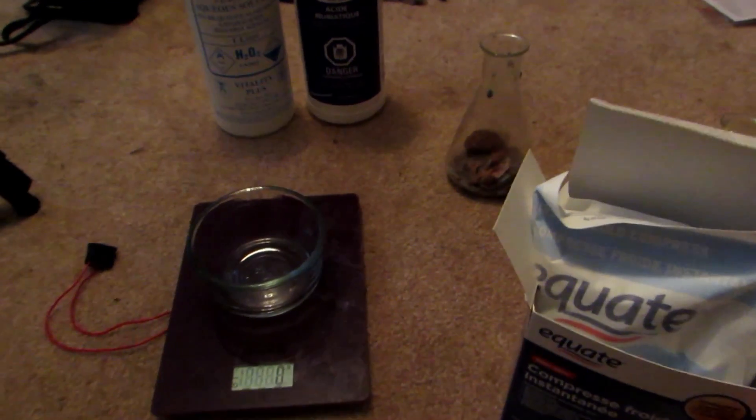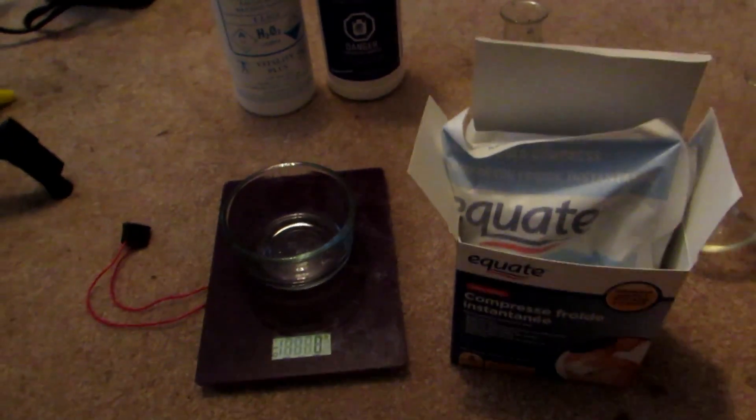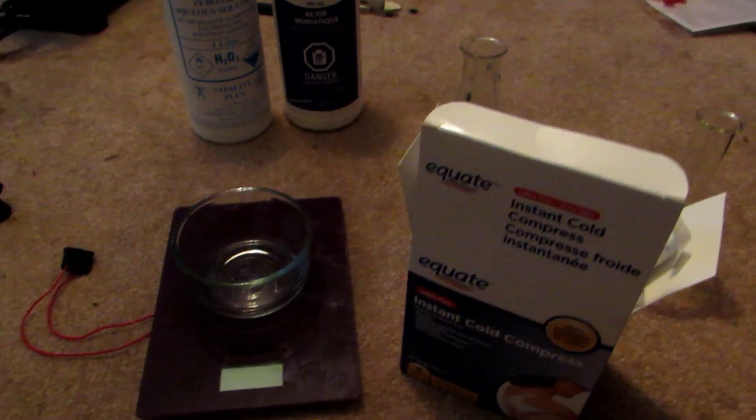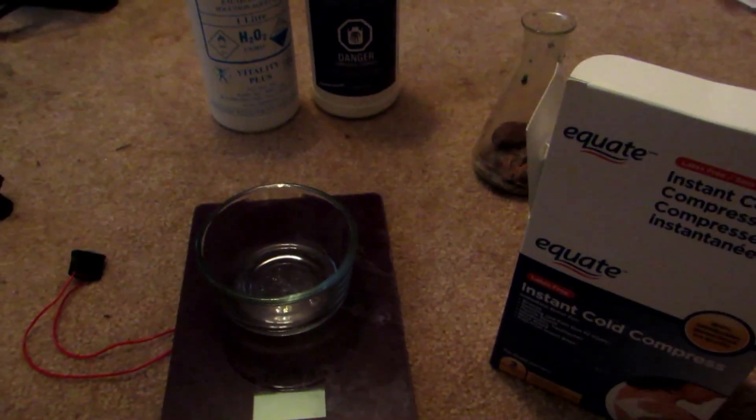So today I'm going to be showing you a separate way where you can take common cold packs — the instant cold compress things — and you can actually take the calcium ammonium nitrate out of here and get nitric acid.